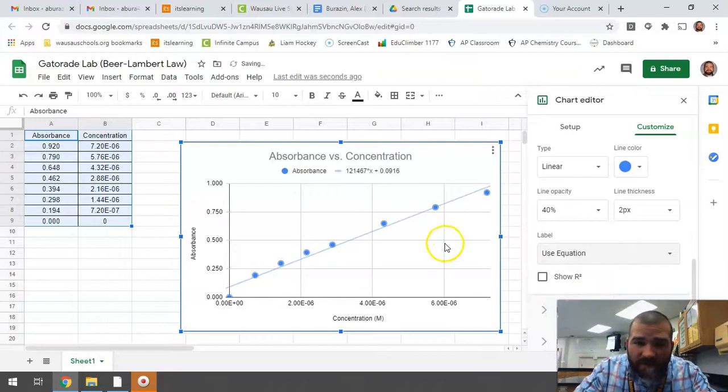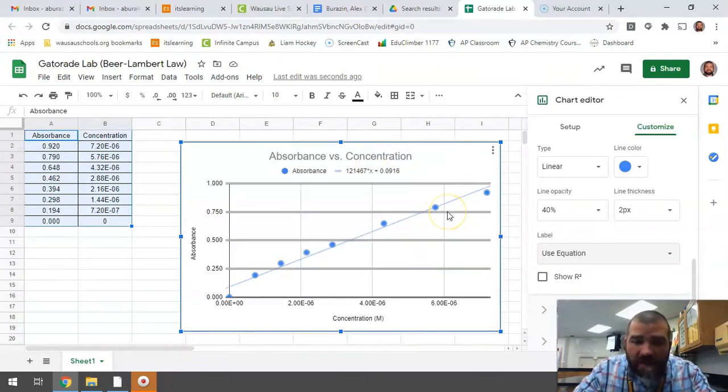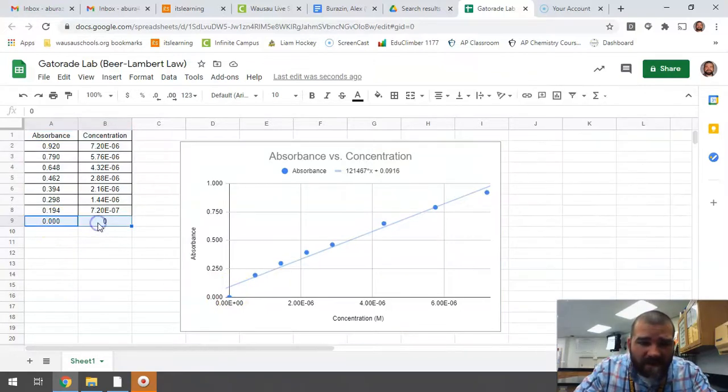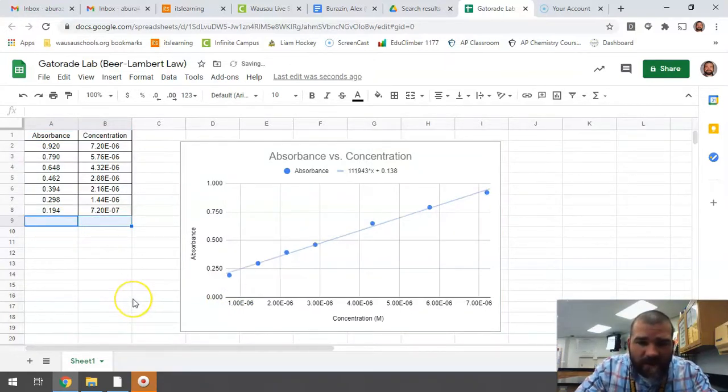That's what's going to help us solve for what we need to solve for in just a little bit. Now, a couple things of issue here, all right? The first thing is you'll notice that here is our intercept, 0, 0 with the water, but the rest of our data is kind of above it, and if we ignore that first data point, we're going to do much better. So let me ignore that first data point.